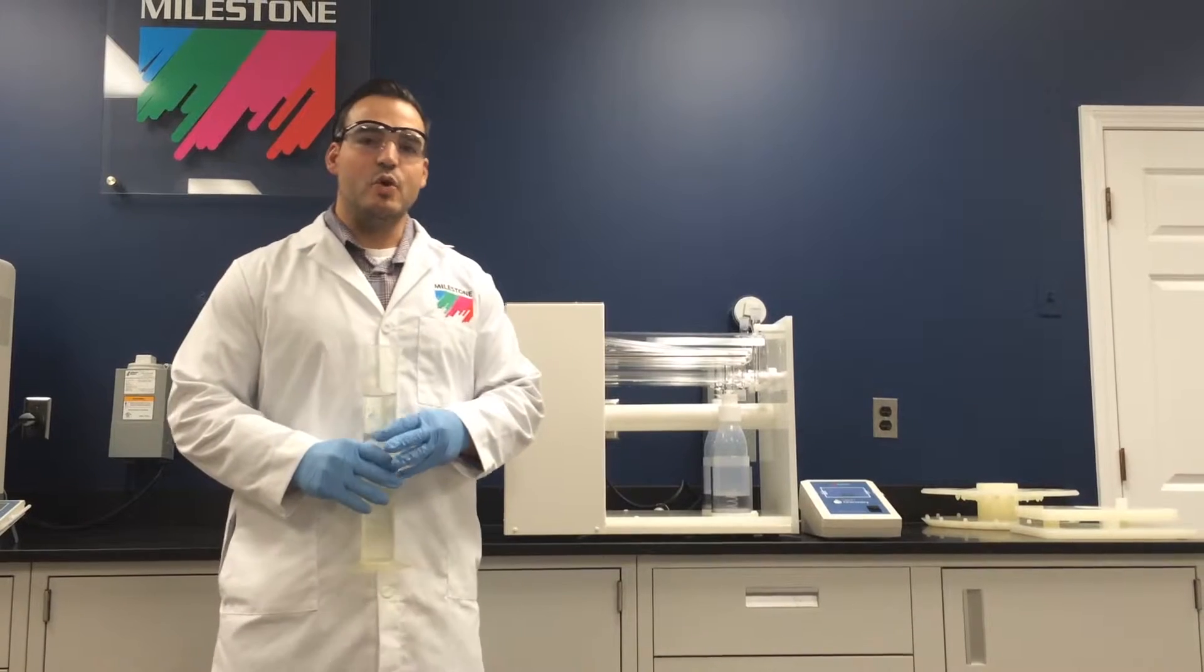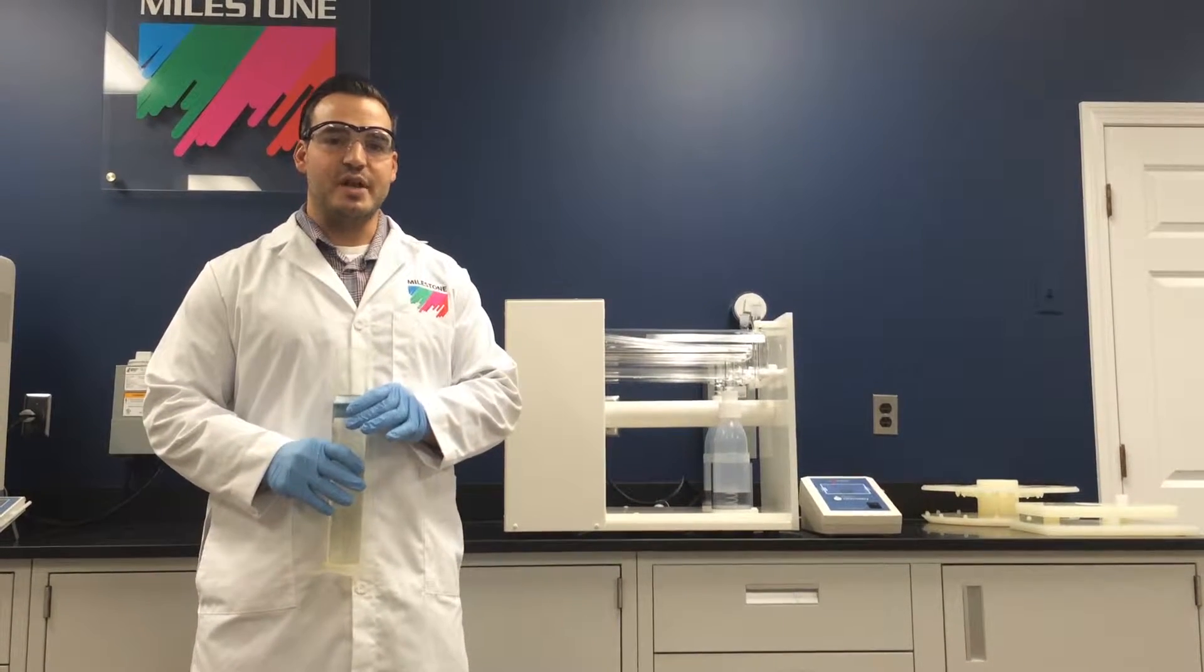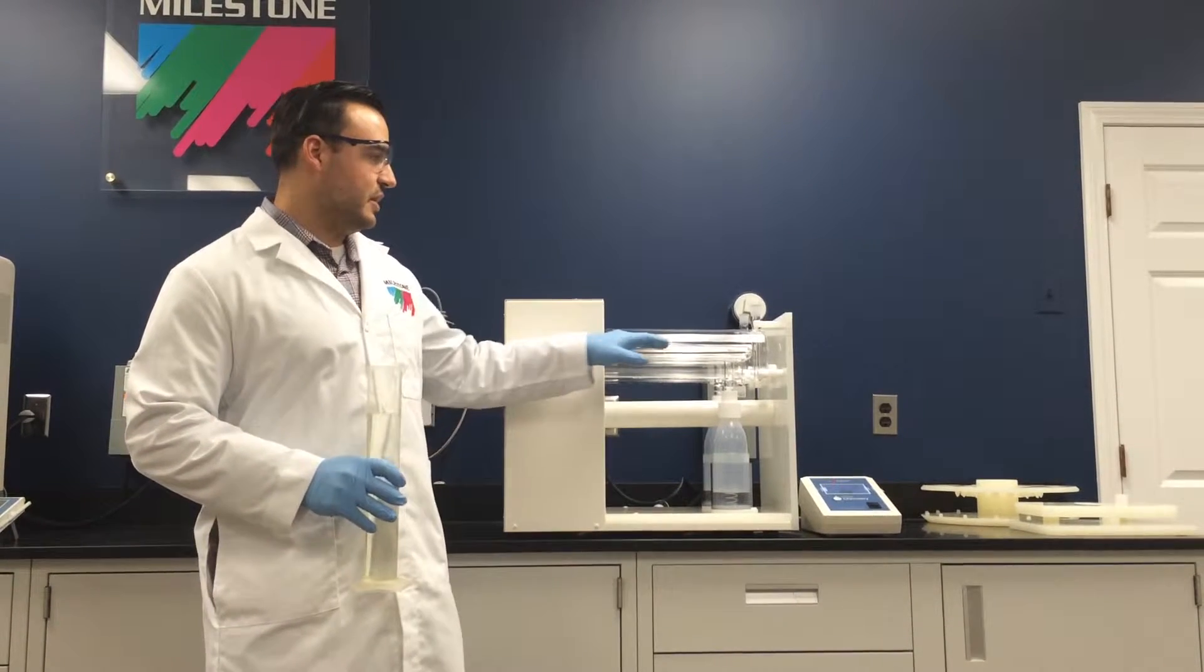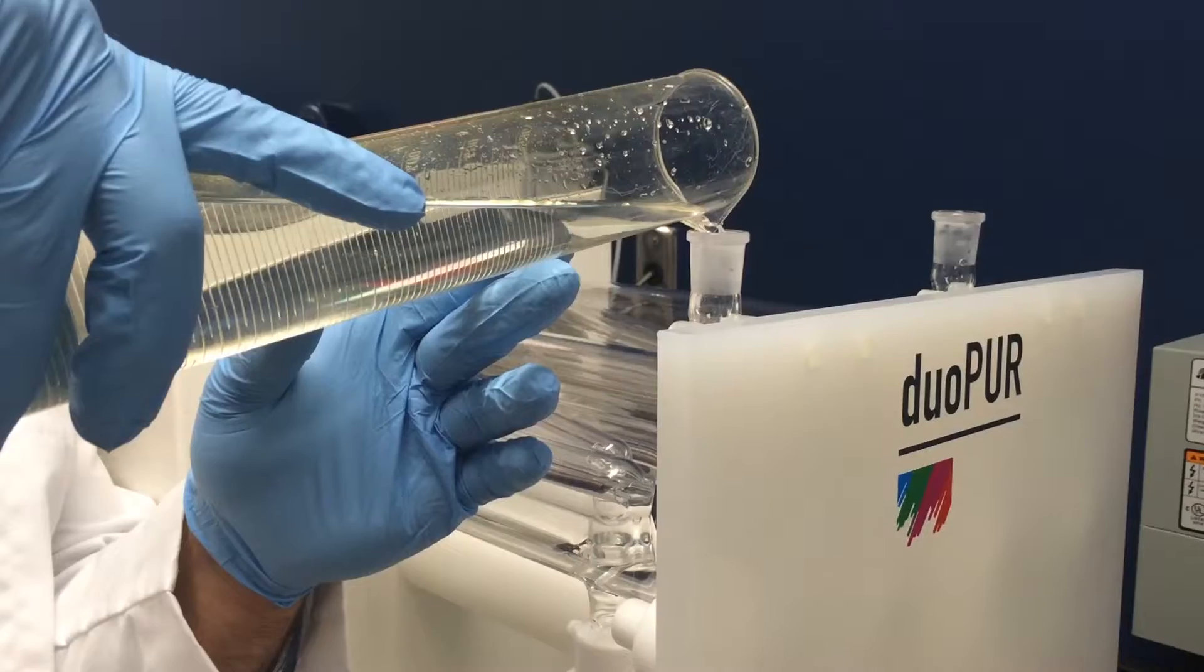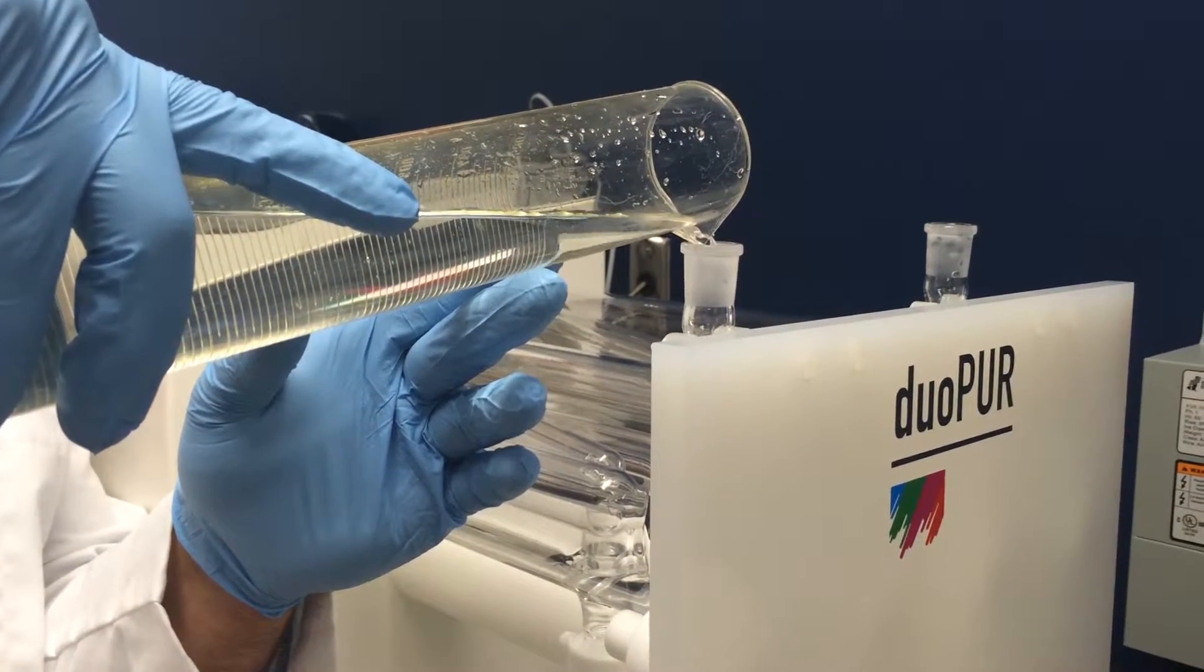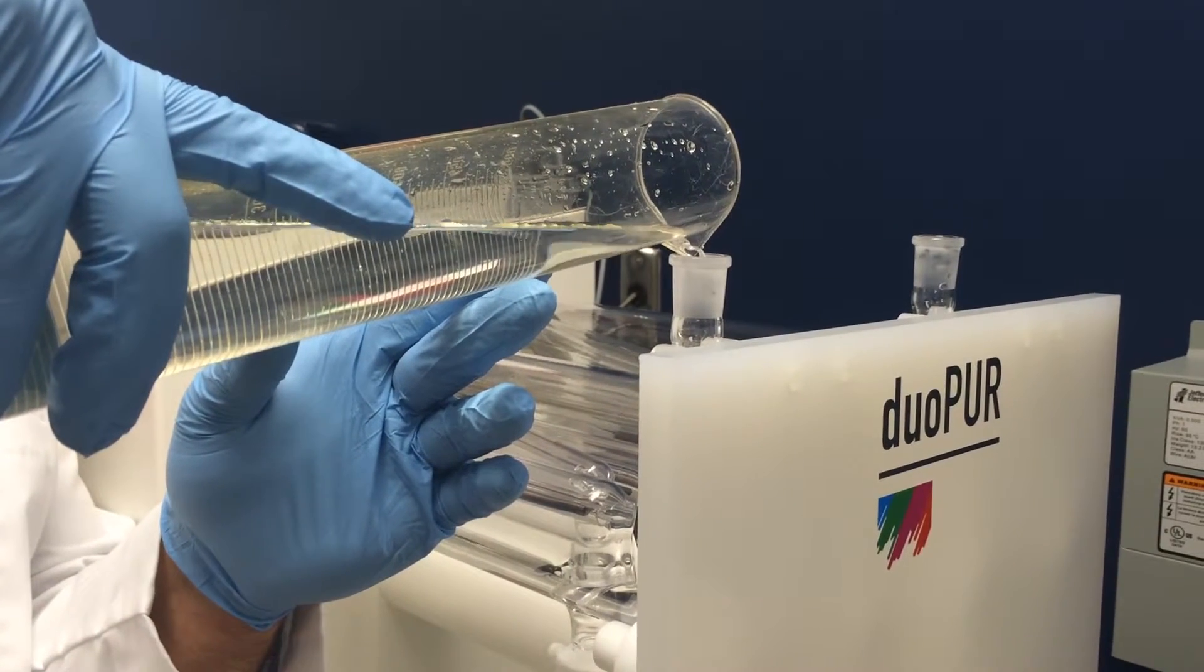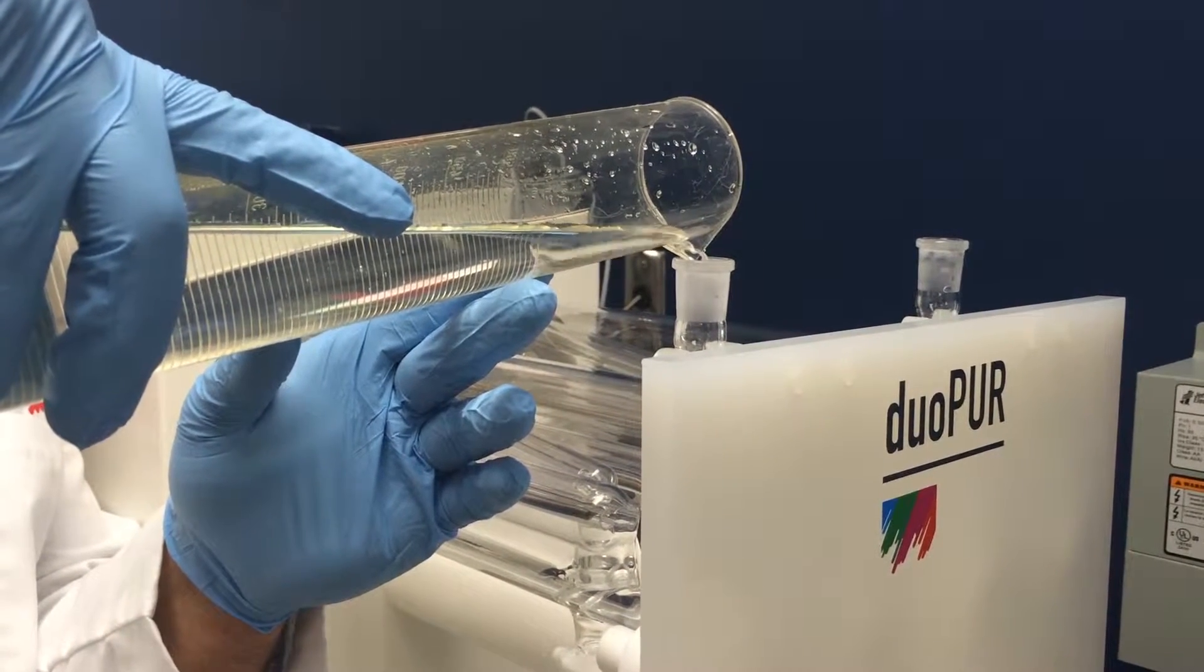The first step in using the DuoPure is to load your sample acid into the distillation chamber. Carefully load the acid into the top chamber of the DuoPure.